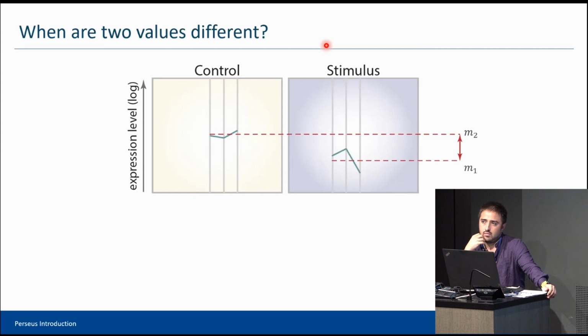I see. So we kind of lose that information. Yeah, in that case, yes. But usually that's not the problem. Usually you always find a transcript when you found the protein. It's more the other way around that you lose information. Okay, thank you.